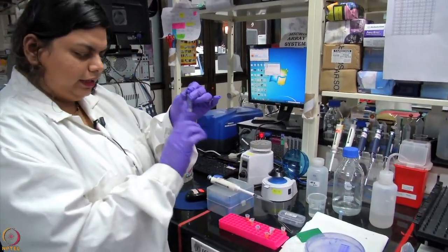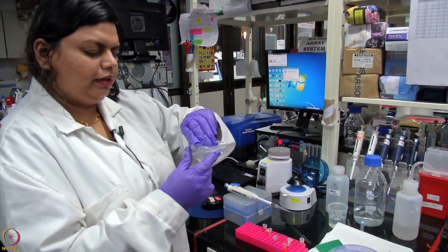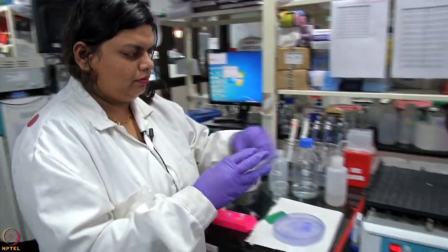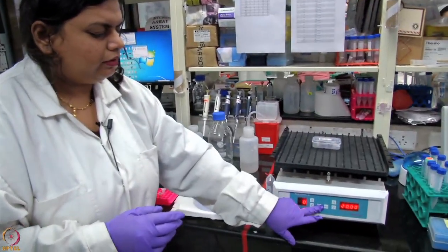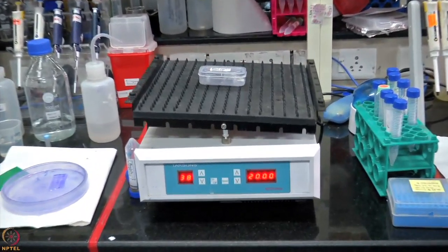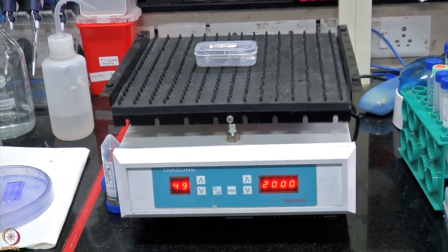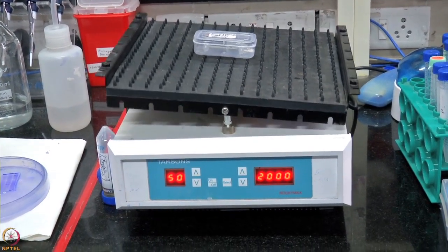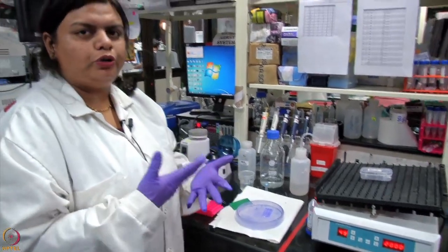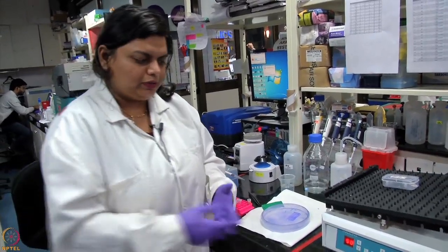And again give it a gentle tap. After that, we'll again put it in the rocker and leave it for a few minutes. Make sure this is not too harsh, you don't do a vigorous mixing or shaking, even in this rotator, because you don't want to lose the interacting partners that have already bound to the protein of your interest.